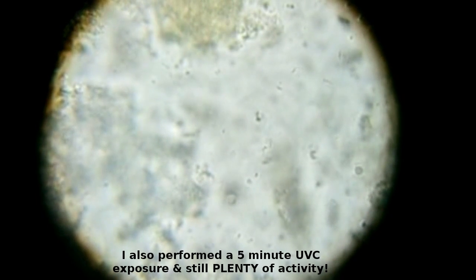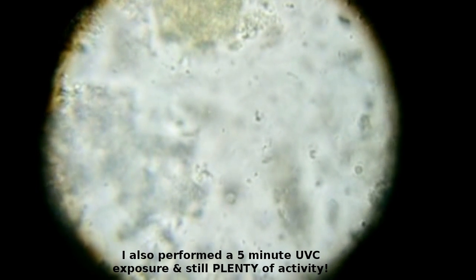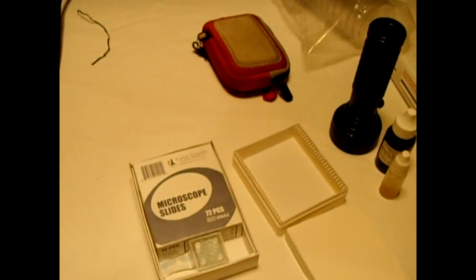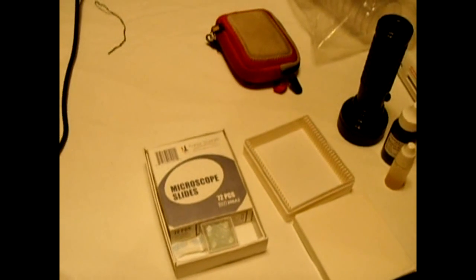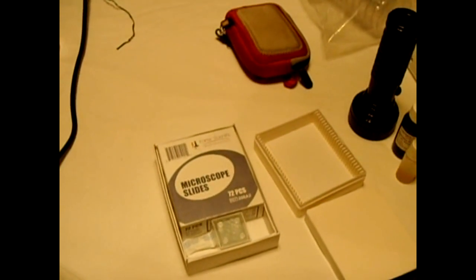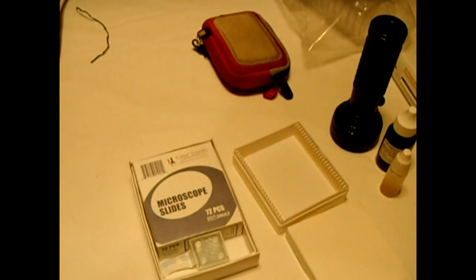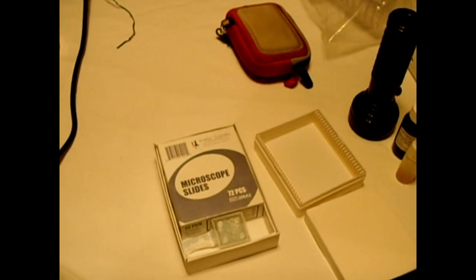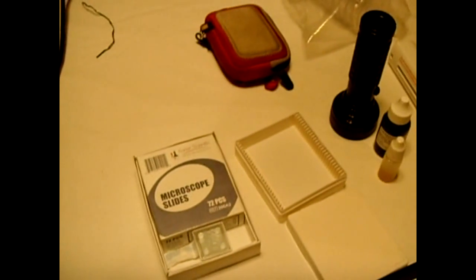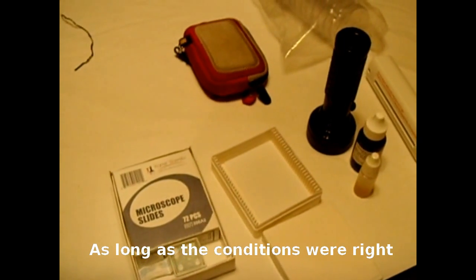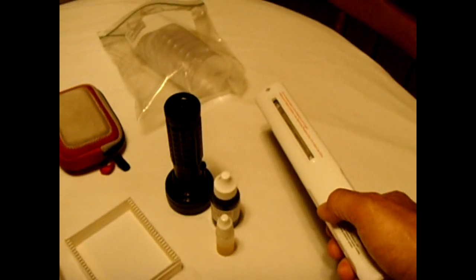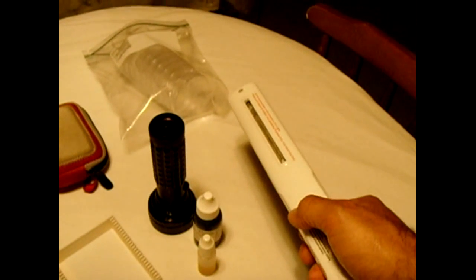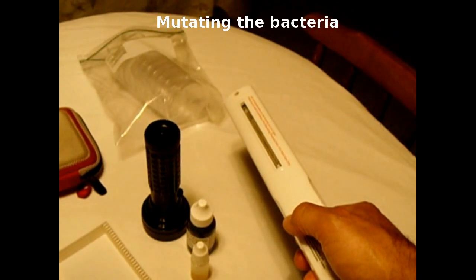So when they say it kills 99.9% in a certain time frame, they really don't mean that it kills it now. What happens, based on the research that I did, the UVC light damages the bacteria, damages the DNA within that bacteria, and it prevents the bacteria from multiplying. Ordinarily the bacteria, if it was not treated by the light, it would continue to multiply. You'd have one, it would split into two, two would split into four. So by using this light, you're not killing them, you're altering the DNA in the bacteria in such a way that it prevents the bacteria from multiplying and eventually they just die off.